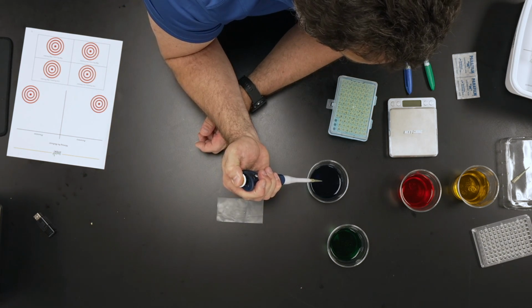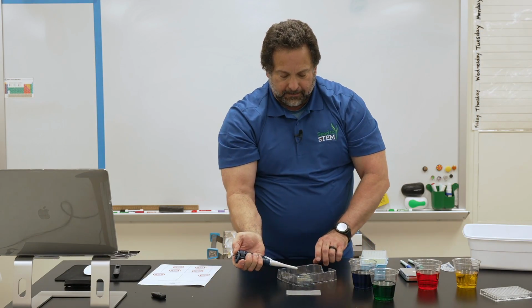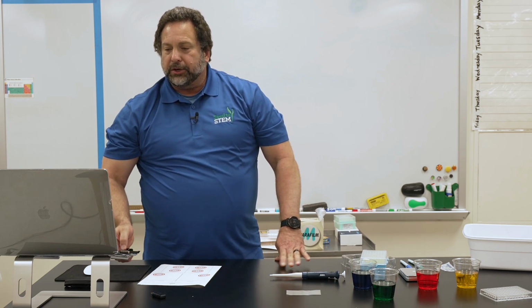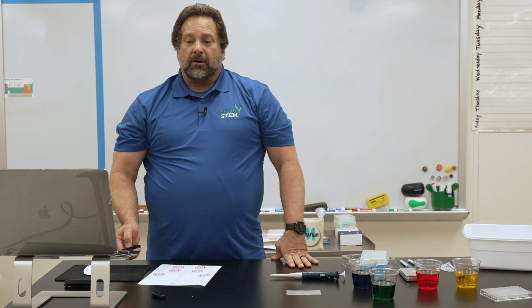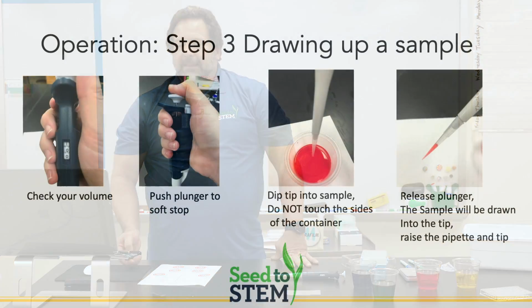So I'm going to expel that liquid out. I'm going to get rid of this tip real quick. And that is part of what this lab is about. The lab is about you trying to practice with that pipetter, okay? So we've got the hard stop, the soft stop, and the hard stop that I just showed you. You've got the liquid you're going to play with.